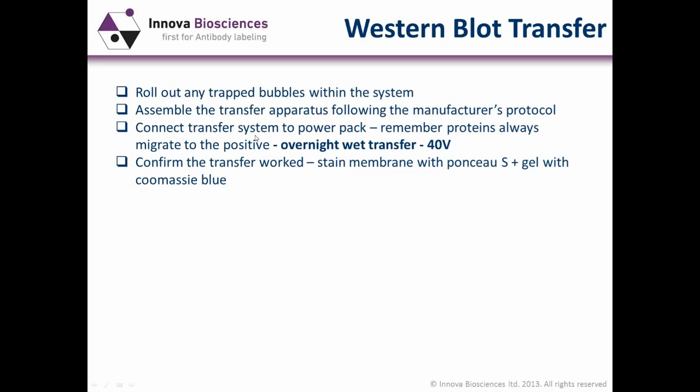Make sure you connect the transfer power supply as recommended, connecting the positive to the positive and the negative to the negative. You don't want your proteins migrating into the filter paper rather than onto the membrane. As I said, I either opted for overnight wet transfer at 40 volts, or sometimes I did it for 8 hours throughout the day, depending on how critical or how fast I needed the result. Then you come in the next day, or at the end of the evening, and you want to confirm that the transfer has been successful.